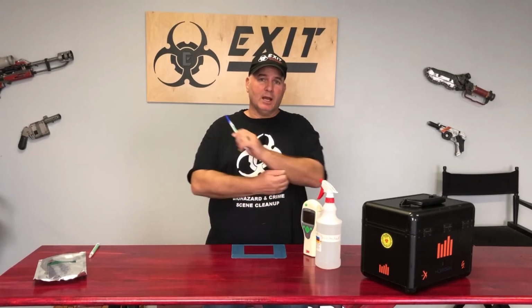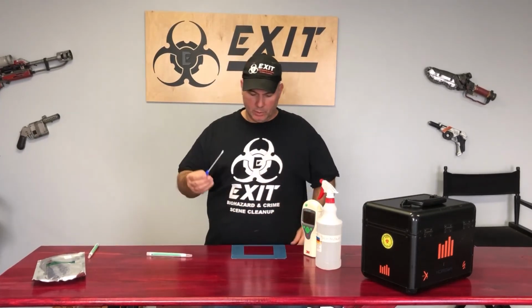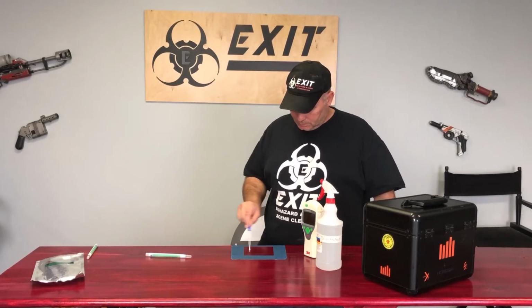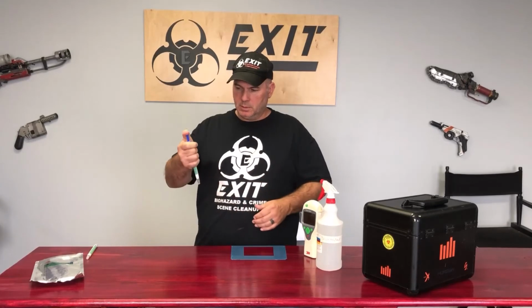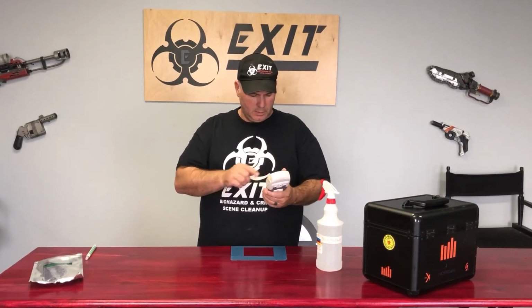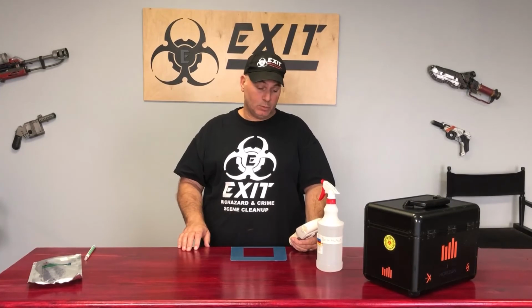That other number was pretty high, but again, who knows who's been in here. The mail guy drops things off on this table. It's always hard to say. So go back and forth again with our swab. Door here. See if we get measuring. Like I said, it takes about 10 seconds for it to do its job. See how our disinfectant is working.